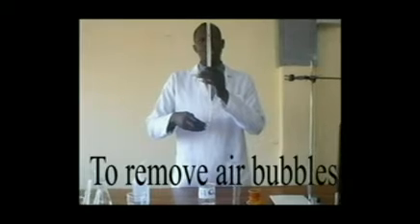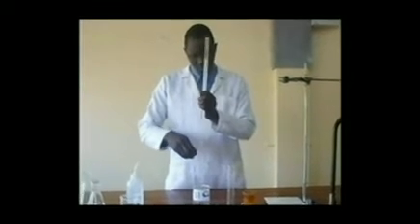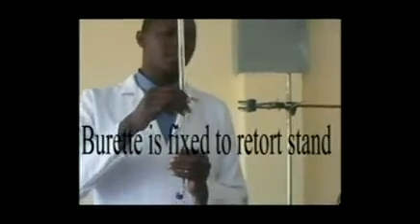Adjust up to the level of 0 degree, whereby the lower meniscus of the burette should touch the 0 reading. Then mark the initial reading from the burette. Fix the burette at the retort stand to about 90 degrees.